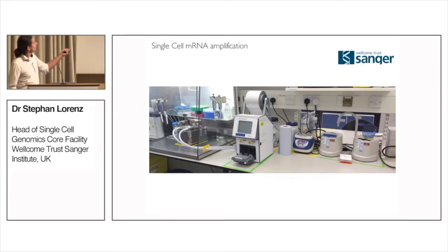The way it works, you have this little arm here, and then you have these chip positions, so there's 2 here and 4 there, and you can see a tube running into this big Falcon tube. So master mix goes in here and then through the tube. There are 2 chips, 100 and 500 nanoliter chips, with 2 chambers, which use direct displacement to aspirate and dispense droplets, and a high volume chip, 1 microliter or 5 microliter. You can feed 6 reagents into it. A straightforward plate, depending on the volumes that you have, takes between 3 and 9 minutes, which is not blazingly fast, but for the time being good enough, considering we can chill our plate.